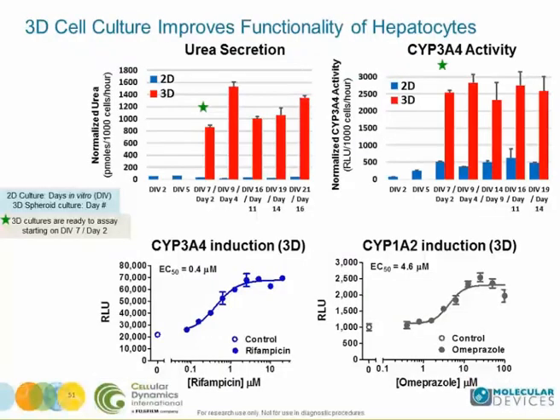On this slide, you can see very significant differences in metabolite secretion, whether it's in 2D or 3D culture. You can see much higher level of secretion of urea and also other metabolic enzymes. Spheroids were stained, as we described before, using mix of 3 dyes, Hoechst, calcein AM, and ethidium homodimer.